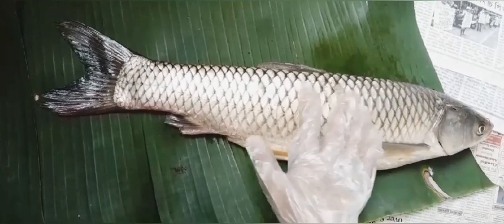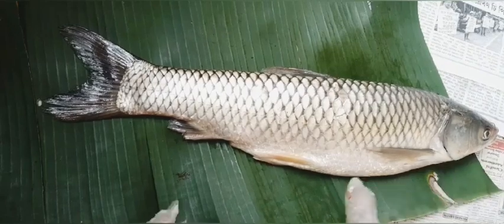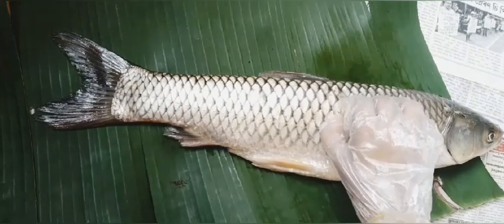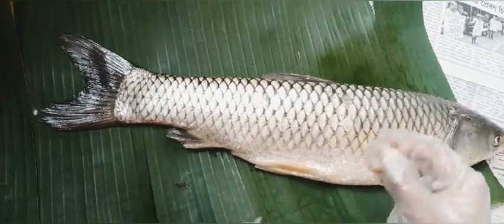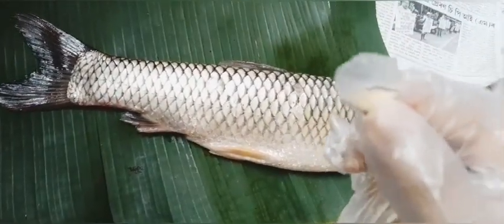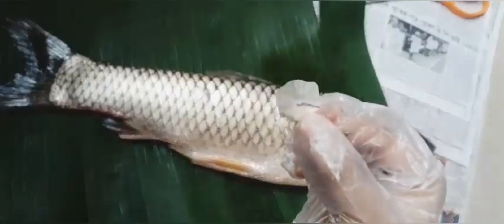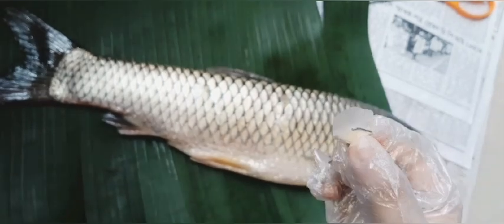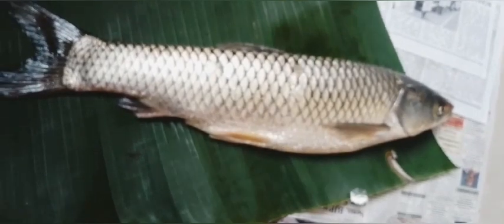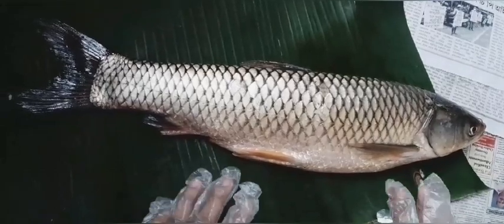Let us talk about the scales. This fish has big scales, which act like a protective armor. It protects the fish. If I take out one of these scales, it looks like this. This is the scale of the fish, and as I said earlier, it acts as a protective armor.